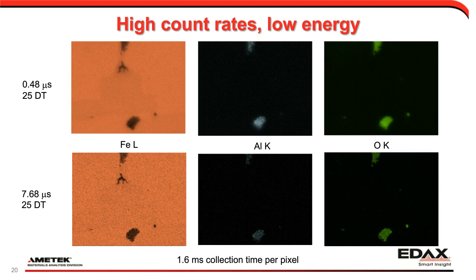We can see the sample is primarily iron, and we have some dark patches in the iron map, one of which is the moly. You can see a slight differentiation. There's a slight gradient in the middle of the map where you have more moly inclusion as well. And we see a couple of other dark spots that show up as aluminum oxide.